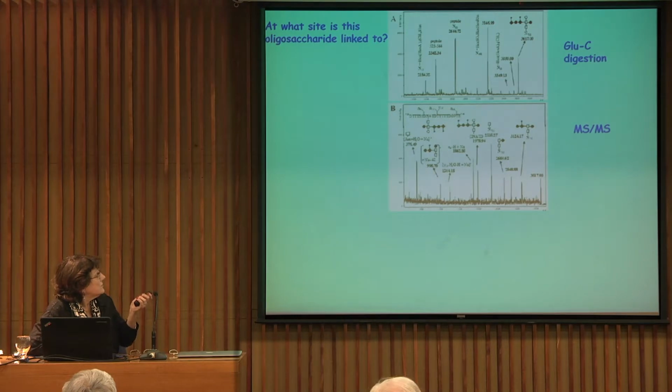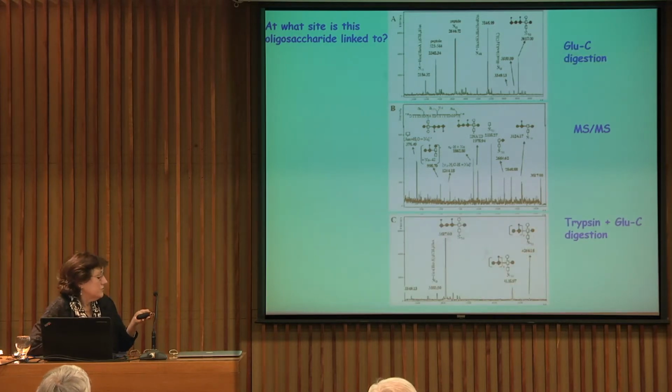Of course, we performed a mass analysis of this ion, and we could detect different pieces of the peptide bearing the oligosaccharide. And so we also performed a trypsin and glutamyl endopeptidase digestion of another gel band in order to be sure, and we could detect signals corresponding to the same site, asparagine bearing the pieces of the oligosaccharide.